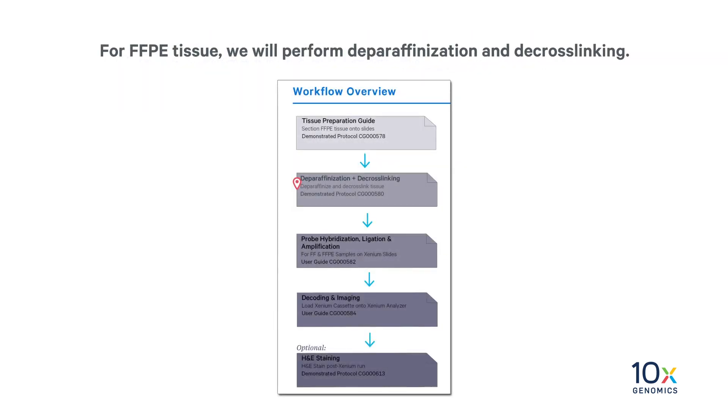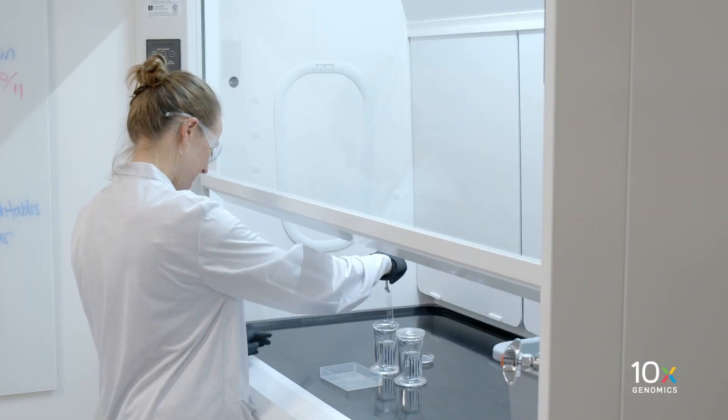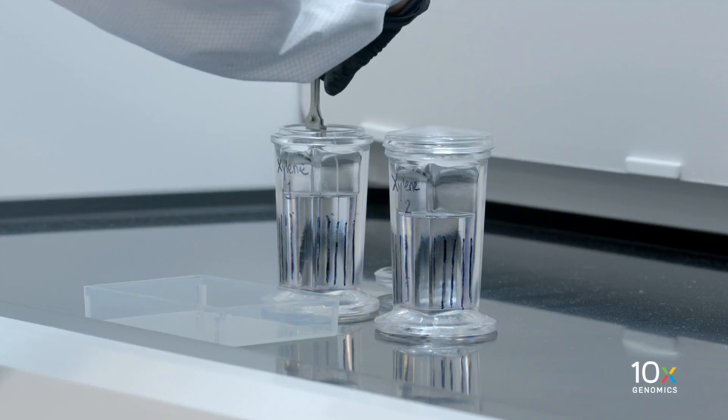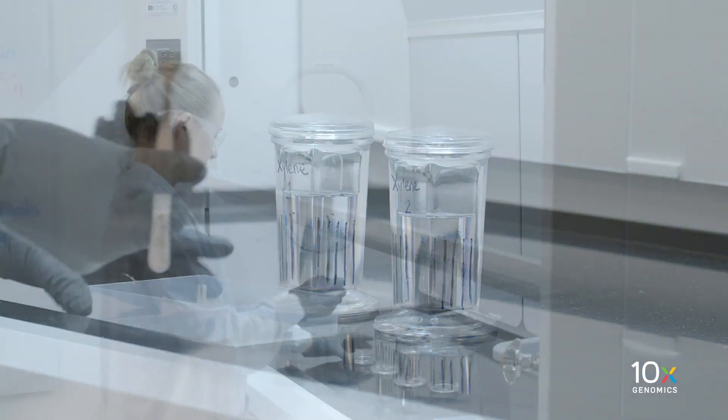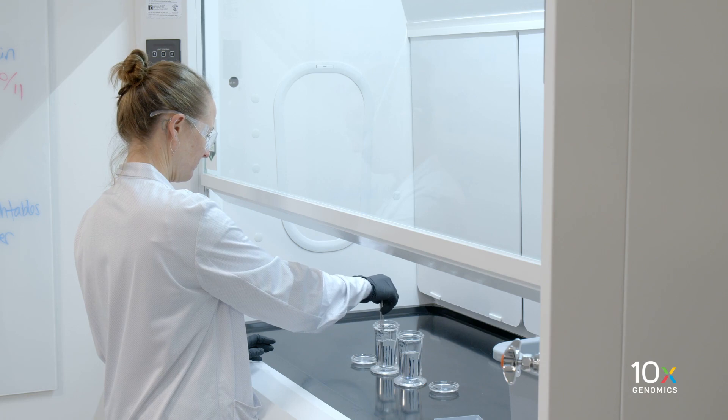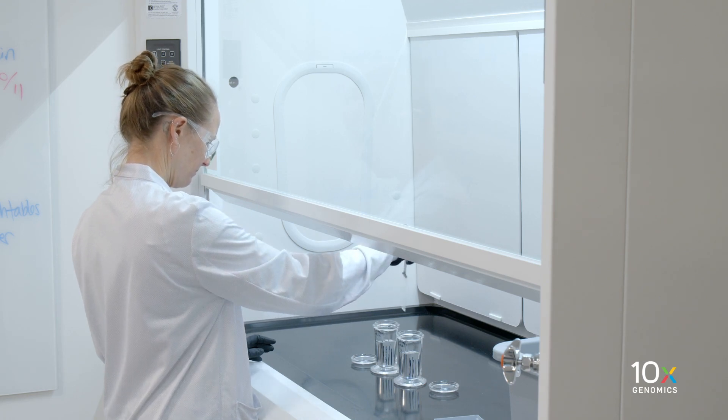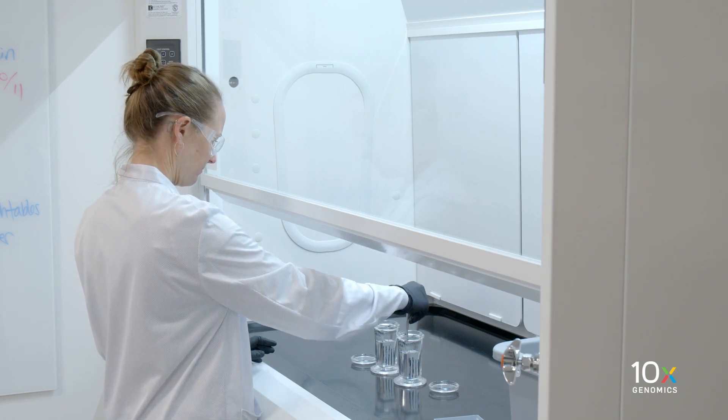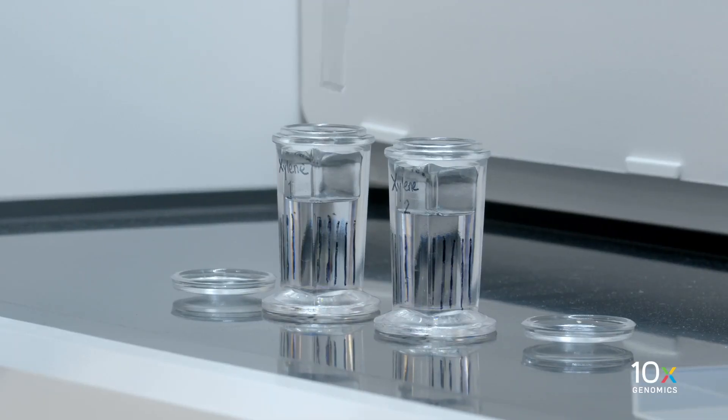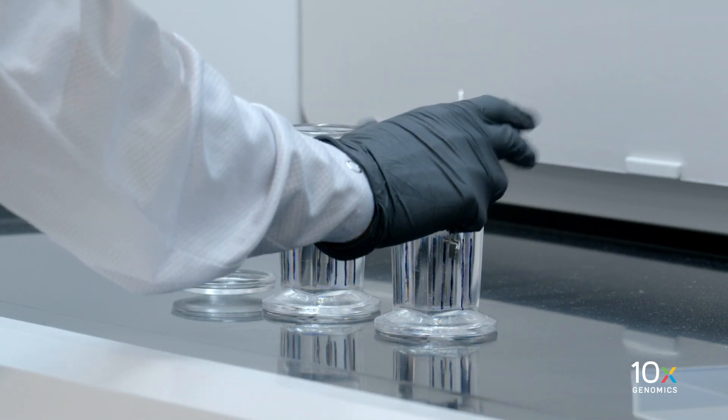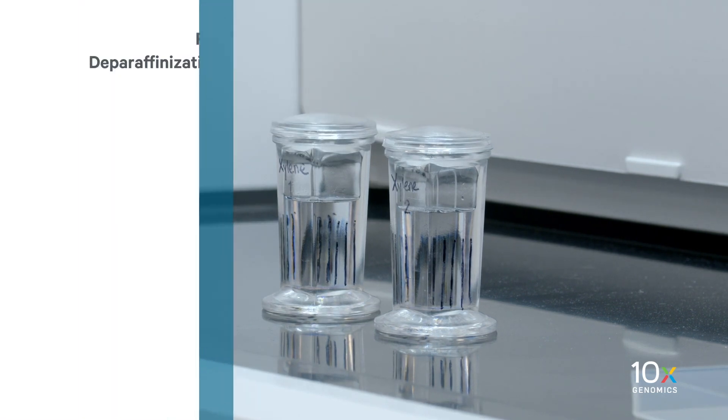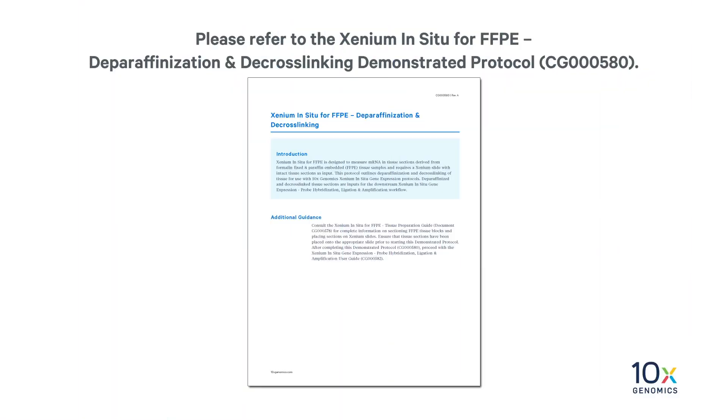For FFPE tissue, we will perform deparaffinization and decrosslinking. This is performed by immersing the slide in a series of coplin jars or staining dishes. Two coplin jars are shown here for illustrative purposes. Additional coplin jars are required. Please refer to the Xenium in situ for FFPE deparaffinization and decrosslinking demonstrated protocol.